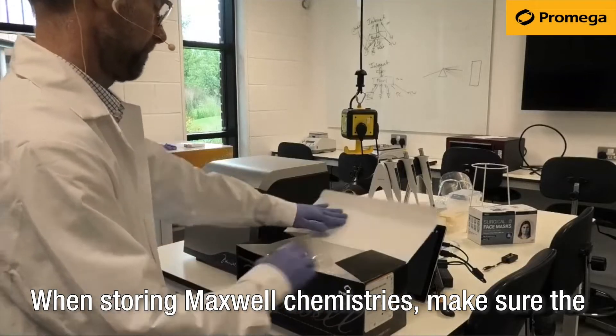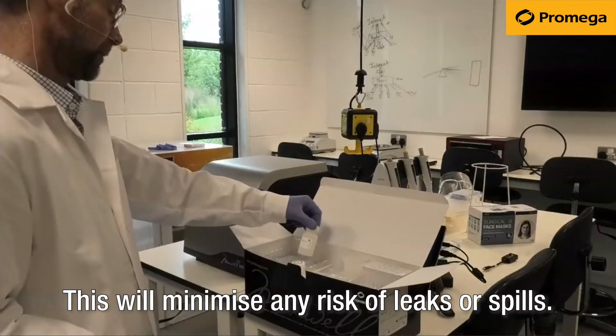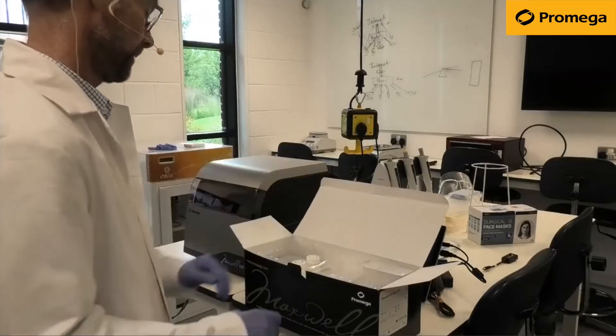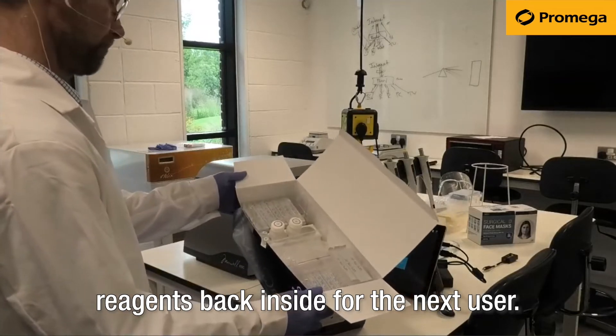When storing Maxwell Chemistries, make sure the box is stored upright with all the reagents in their correct positions in the box. This will minimise any risk of leaks or spills. When you are finished with the kit, place the reagents back inside for the next user.